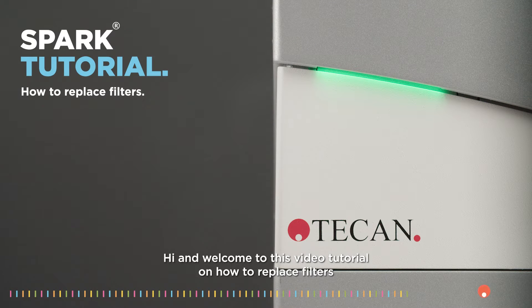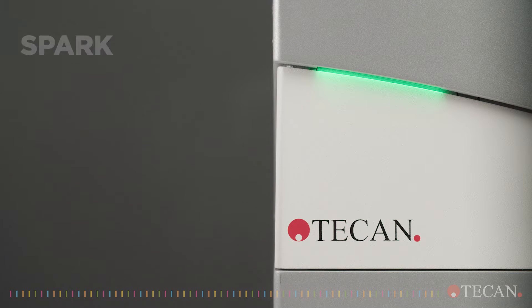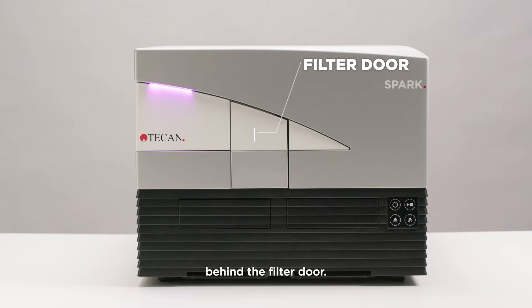Hi, and welcome to this video tutorial on how to replace filters for the SPARK instrument. The filter slide is positioned on the front side of the instrument, behind the filter door.